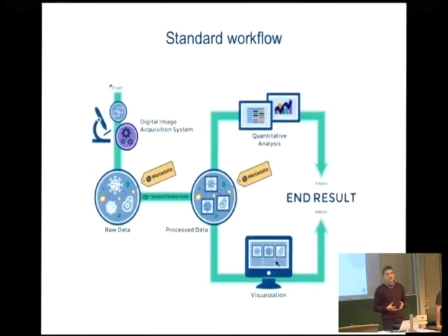Each manufacturer of a microscope tries to log their users into their specific file format, their specific desktop client. So sharing that image between scientists in a single lab or between lab groups can be very, very hard and frustrating, especially if you work in a facility where computational time is being bought by the hour. Then what happens with the closed source format is being reduced in resolution for presentation and rendering in the client, and also the access is local, so not many pieces of software make use of the client-server paradigm that has been in use for many years.